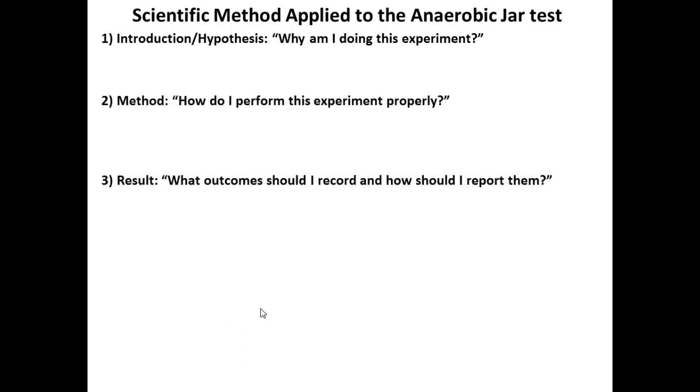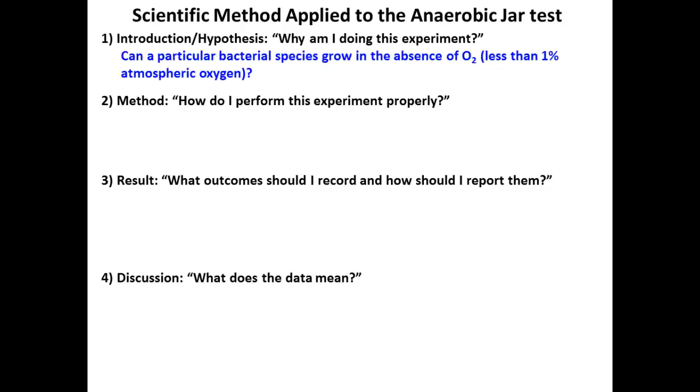So anaerobic jar: why am I doing this experiment? How is it performed properly? What outcomes? And what does this data mean? Can a particular bacterial species grow in the absence of oxygen, less than 1% atmospheric oxygen?